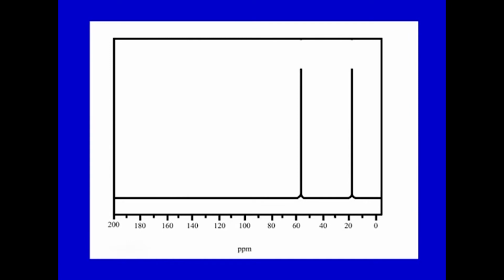So, if there is a more electronegative atom, there is more de-shielding and a shift. You can see there are two peaks for the two carbons, and one is shifted to the left, which is connected to the electronegative atom, rather than the other carbon, which is simple. These peaks depend on their electronic environment. For proton NMR, where the proton acts as the resonating nucleus, in the 1H NMR spectrum of ethanol, the two protons of the CH2 group neighboring the oxygen are further to the left, while the hydrogens of the CH3 group, most remote from the oxygen, produce a signal towards the right. So, the one closer to the oxygen has a higher chemical shift compared to the one connected simply to carbons.